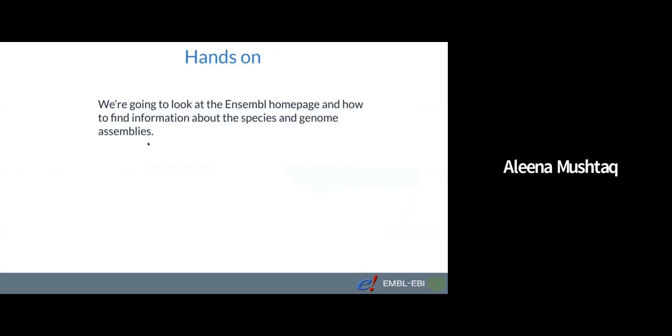So now I'm going to jump out of my presentation and move to the demonstration part of the webinar. So I will take you through the Ensembl homepage and show you how to navigate the browser. And then we're also going to look at the different data tabs that are available in the Ensembl browser.